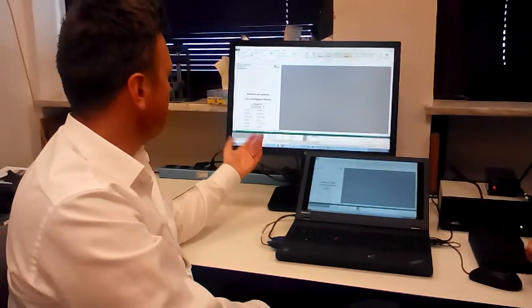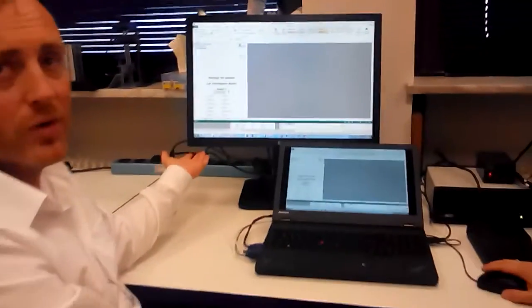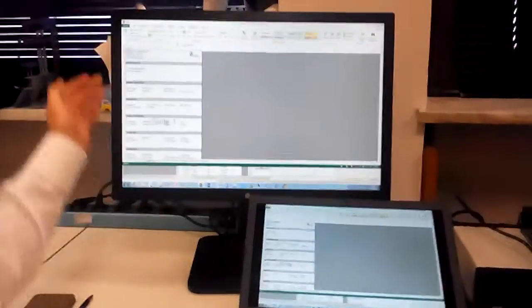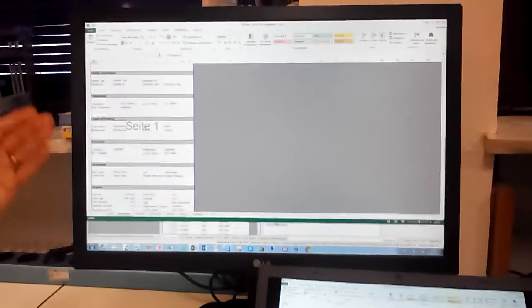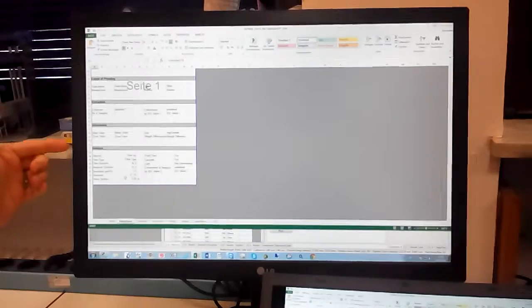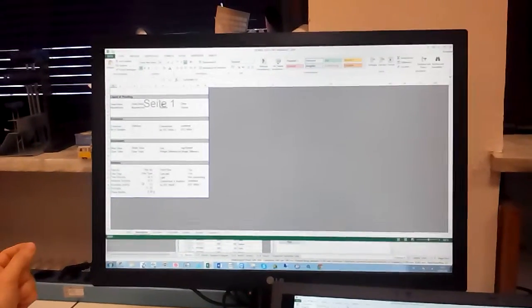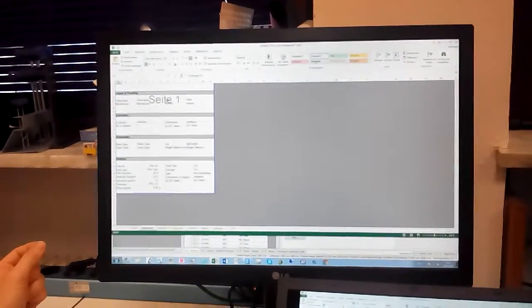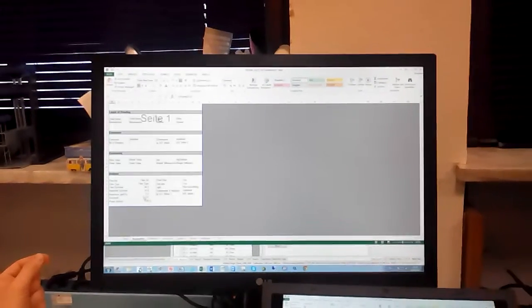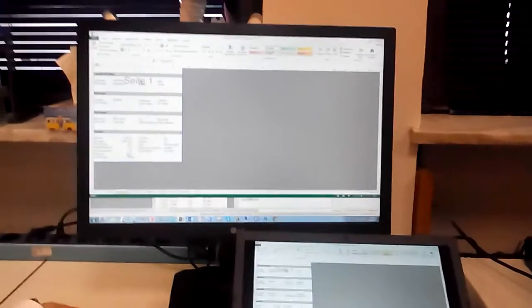So Karen's clicked save, it's opening up Excel, and there's our report straight away, auto-generated with all of the data contained within. It breaks it down into different tabs here. There's our information that we entered about the customer details and perhaps an order number. We also have, sorry Karen, these would also be interesting: the resolution you measured, then the threshold we are using. Yeah. And the phase fraction means the relation from particle to filter area. Right.